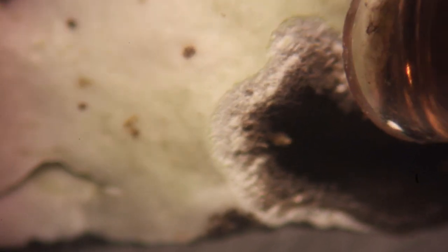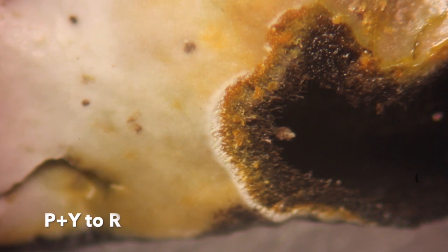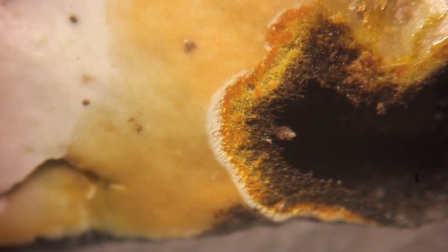Our last example of a P reaction is a P plus yellow to red. As you can see, this reaction develops quickly and quite dramatically.